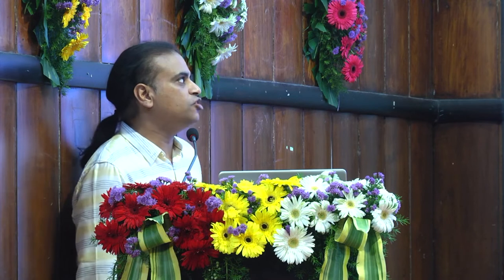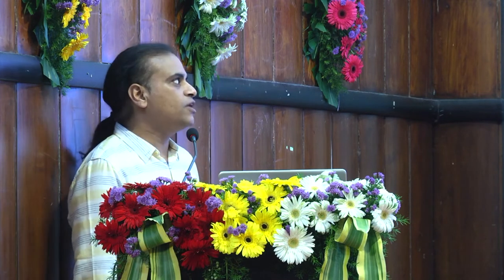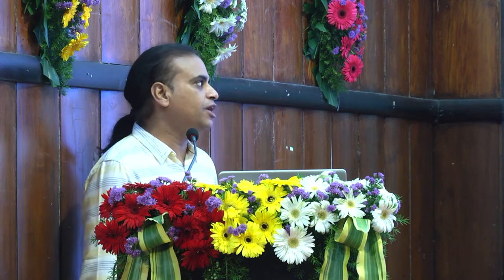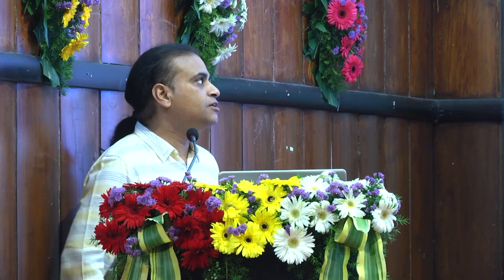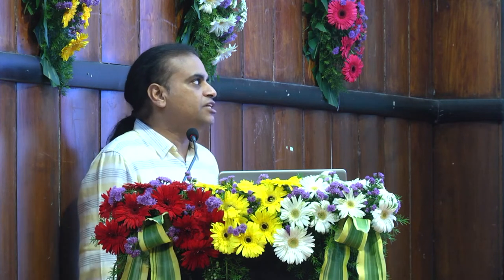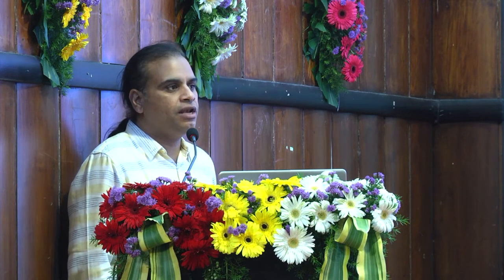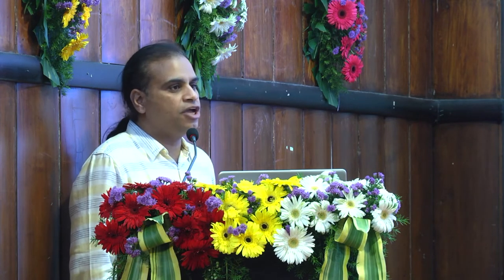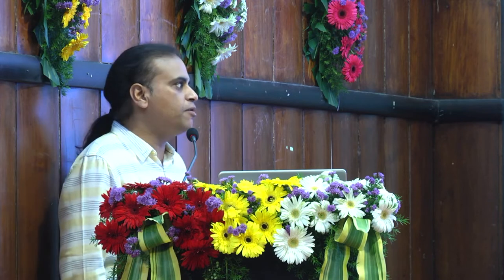This slide will tell you about the introduction of metagenomics and 16S. First, why do we do metagenomics, why do we do 16S, and why are we doing microbial profiling? As you all know, metagenomics is used for characterization of the many genes in a microbial population, and 16S you do in a mixed microbial population. If you have to do microbial profiling, you have to do targeted sequencing for bacterial typing research.